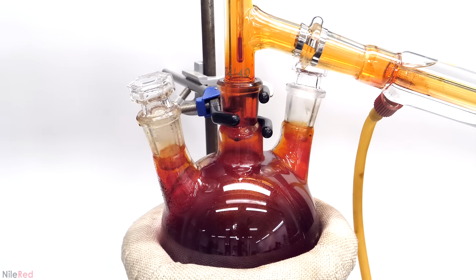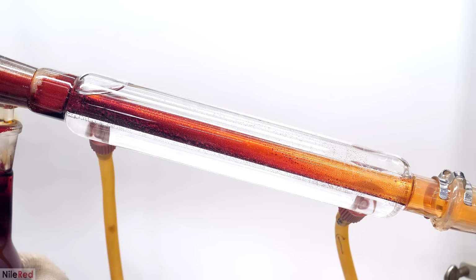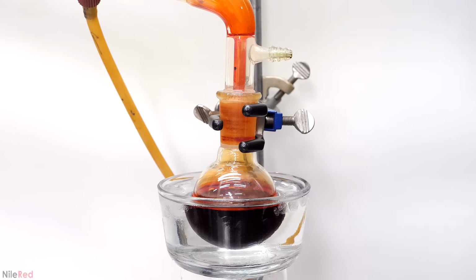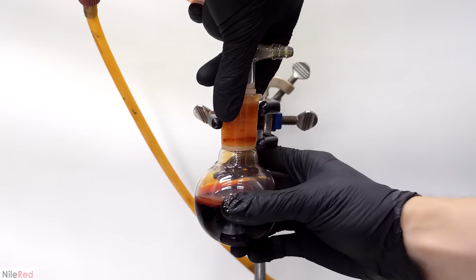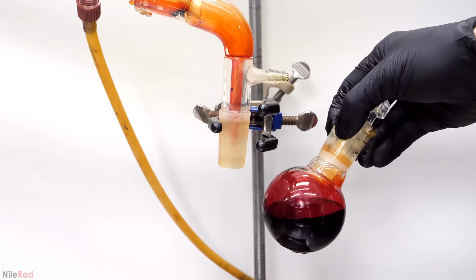When I made the chromyl chloride, I did it in a flask that was already connected to a distillation setup. This way, after it was made, I was able to immediately distill it and separate it from the side products. I collected everything on the other side of the setup in a different flask, and when I was done, I just took it off. This left me though with an entire distillation setup that was covered with chromyl chloride, as well as a reaction flask with all the side products.